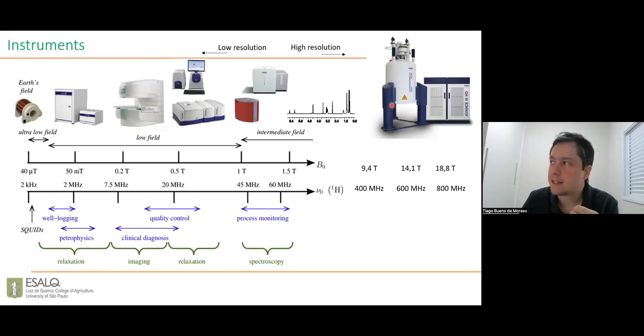So comparing these traditional chemistry NMR laboratories with the benchtop equipment, of course, the strength, the homogeneity, and the stability of the superconductor magnets are much better and are needed for applications in very complex samples, like biological samples, solid-state materials, nuclei of low sensitivity, and many other scientific techniques.